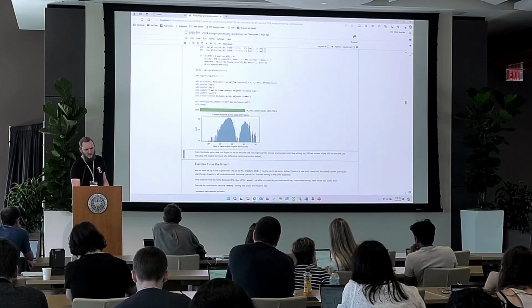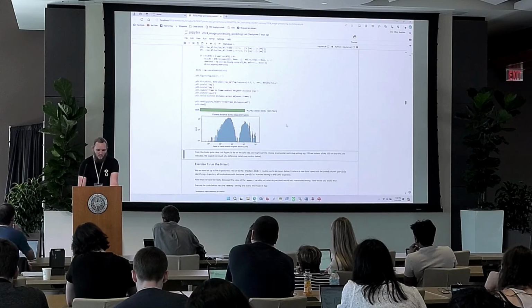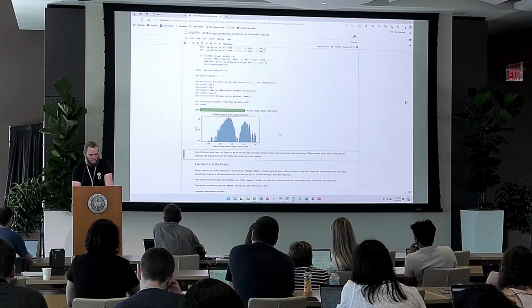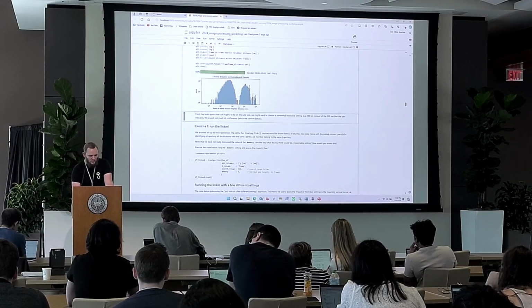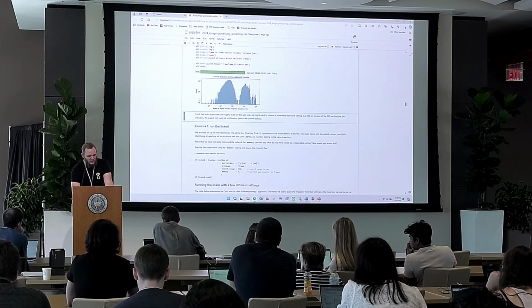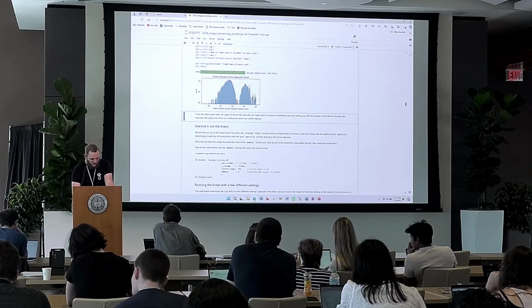What you can see here is that these two modes are very nicely separated in this example. In other data sets, this might be a bit more smeared out. Here, this is very clear because the labeling in the image is reasonably sparse, and the movie is reasonably sparse. So this is a nicely principled way to set a linking distance. If we look at the x-axis, we can set 300, or maybe be a bit more conservative and set it at 200. It's not going to make a lot of difference. Note that the y-axis in this plot is also log scale, so this thing down here is like 2 units.